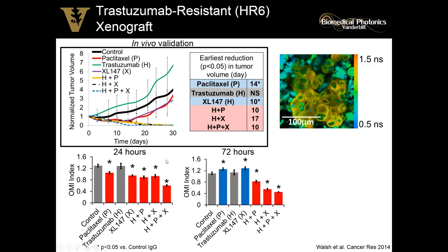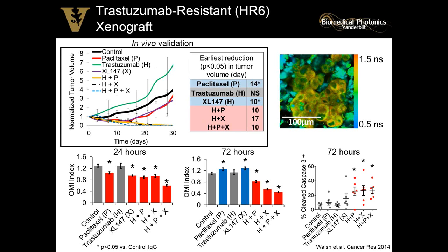In the combination treated tumors, we see response both at 24 hours and at 72 hours, indicating sustained response. This again agrees with standard measures of apoptosis in the organoids at 72 hours post-treatment, which again show sustained response in the multi-drug treatment groups.